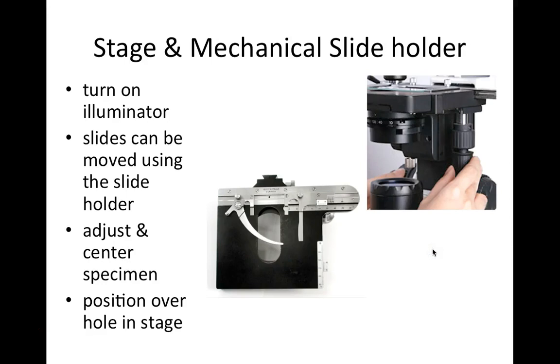We have the stage, which is the flat platform, and there's an opening in the middle through which light from the illuminator passes through the condenser, surrounding and illuminating our specimen on the microscope slide. The slide can be moved around using the mechanical slide holder, which can be adjusted on an XY axis using the knobs hanging down on the right-hand side below the stage, so you can position your specimen at every possible location on that two-dimensional surface.